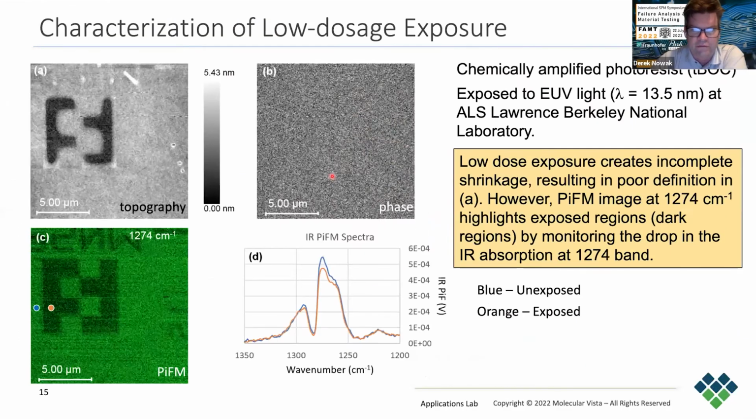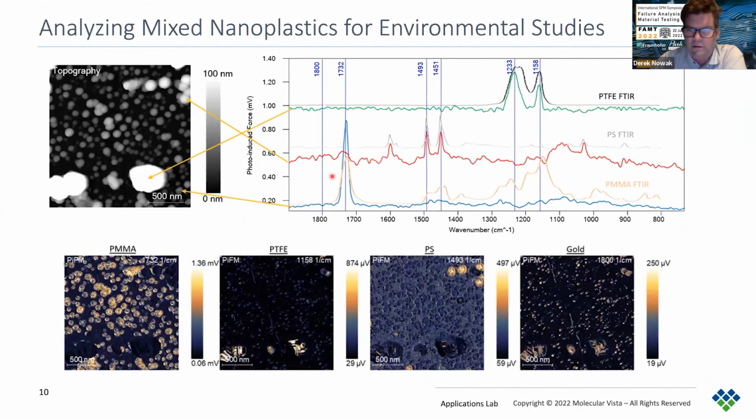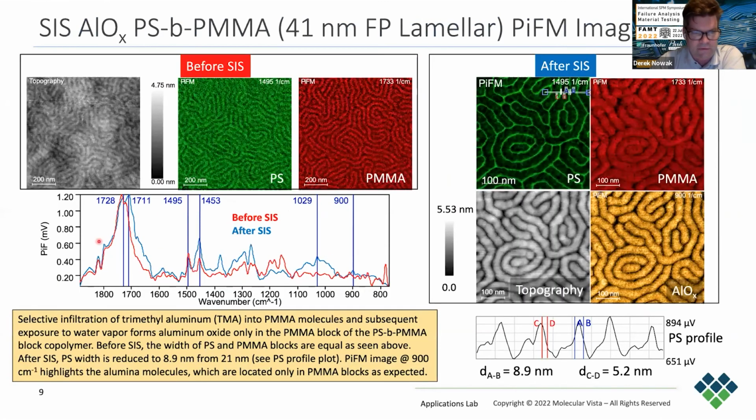So you're referring to something like this spectrum here. One side, red picture, PMMA distribution. Is that quite a big area? Yeah, I apologize. I don't know if I'm fully following the question. I mean, of course, if we're interested in how much area coverage, let's say, one chemical has versus the other, we could post-process that and determine area. Okay, that's the writer. Yeah. Okay.